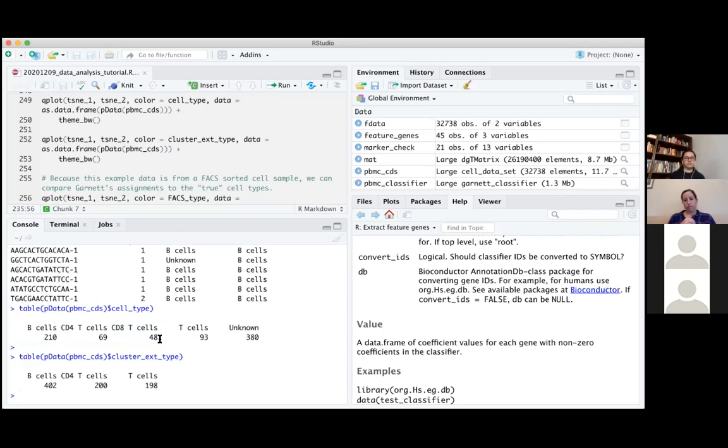So in some analysis I've had, a cell type has a really small amount of cells. If that's going to get engulfed because of the extension, is it possible to then use a combination of these two techniques? Yeah, definitely. There is no hard and fast rule to use one or the other. You can use it in combination as well.